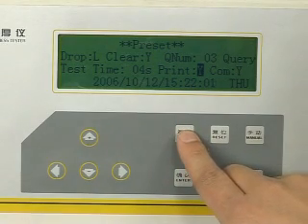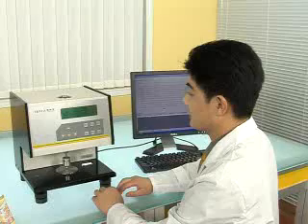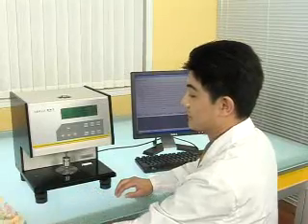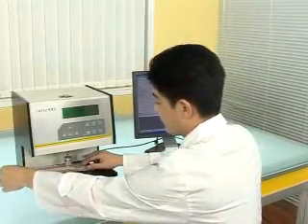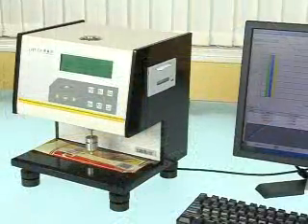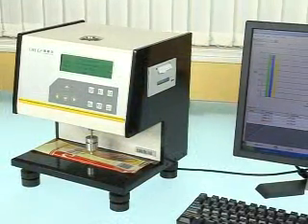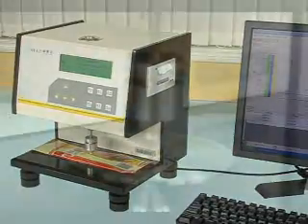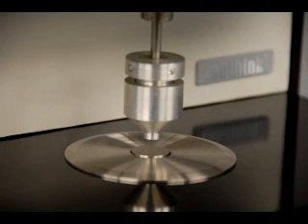Alternative test modes of manual and automatic. Test results are automatically analyzed and printed. Computer communication port available. Compatible with ISO, ASTM, and multi-fold test standards for film thickness.